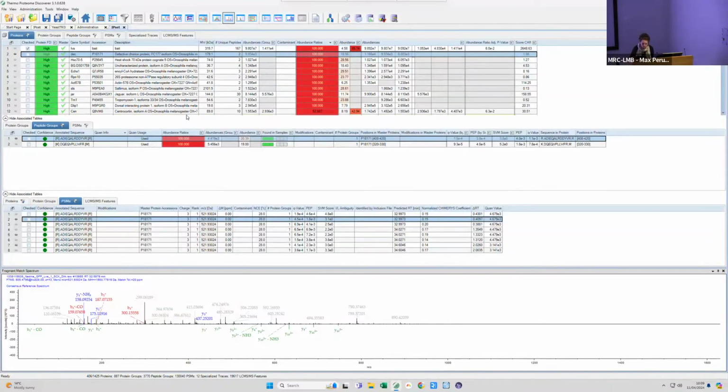Right. So let's go back to the IP set. I don't think I have anything else. Do you have any questions?